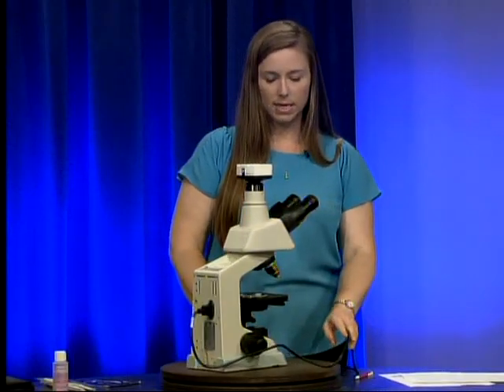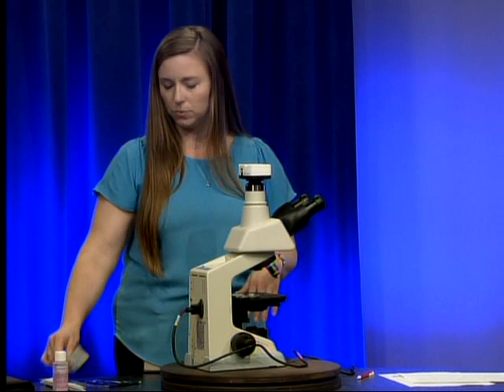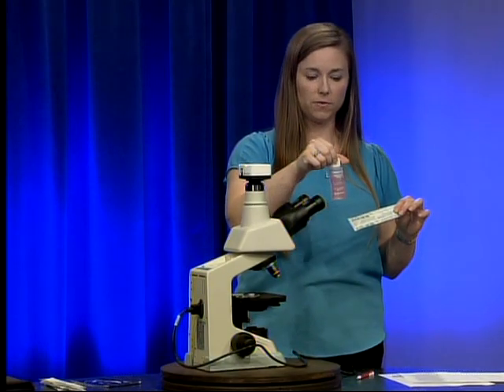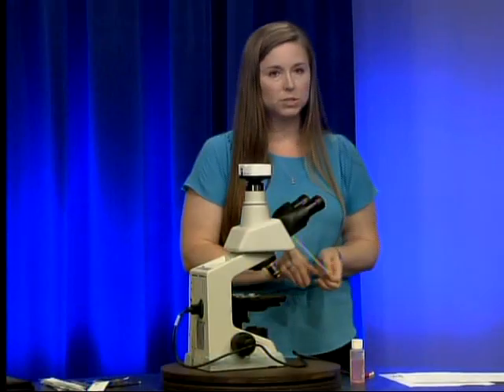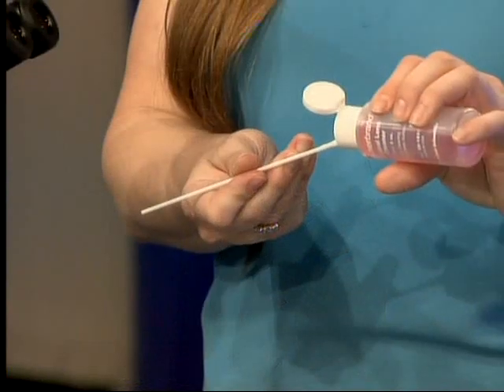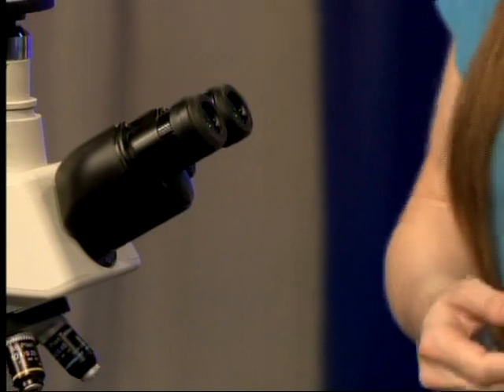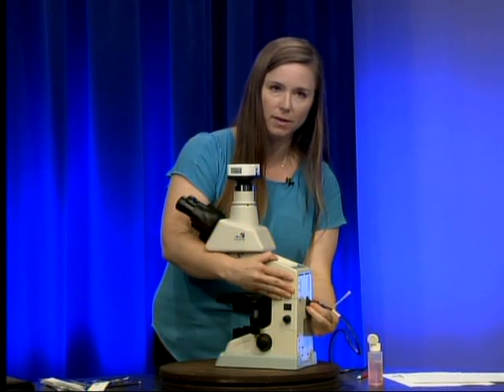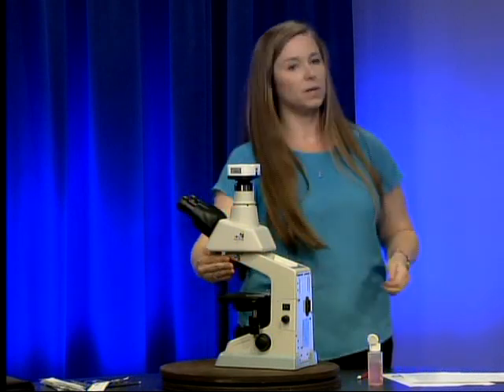We're going to start from the top of our microscope and clean from the top down. We'll use our lens swabs and lens cleaner intended for use with microscope lenses. I'm going to take a swab and moisten it with lens cleaner — just a couple of drops; you don't want to over-saturate the swab, just moist. Before you start, make sure to unplug your microscope — we don't want to be applying liquids to a plugged-in microscope.